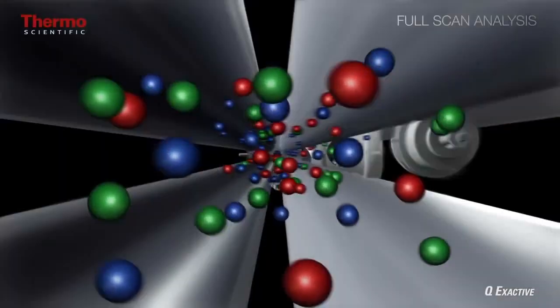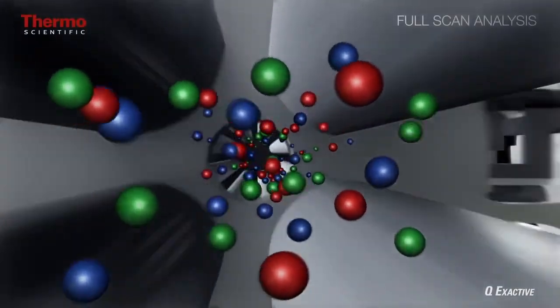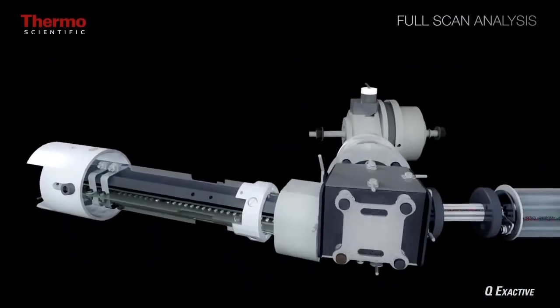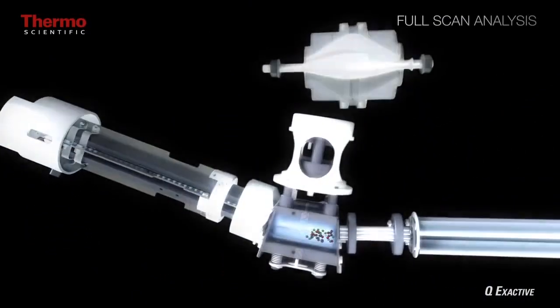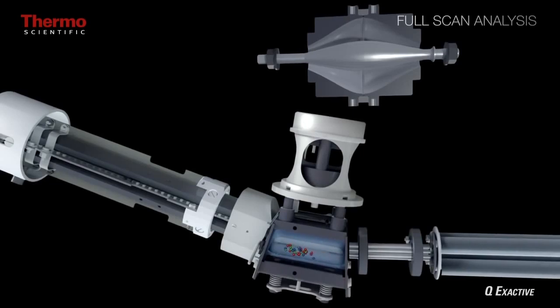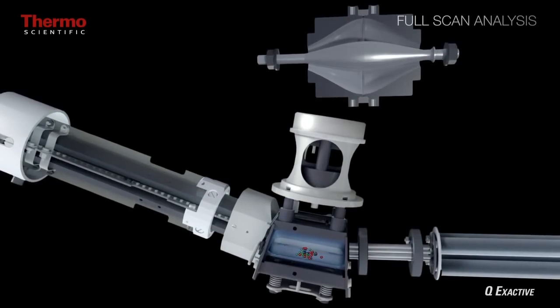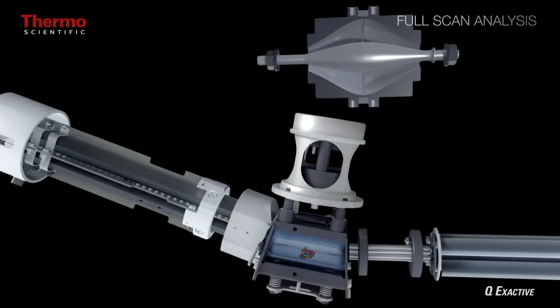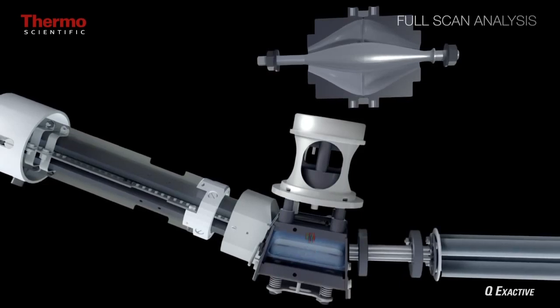And since this is a full scan MS1 analysis, all ions are passed through the quadrupole, collected into packets in the C-trap, stabilized, and sent to the orbitrap for detection.